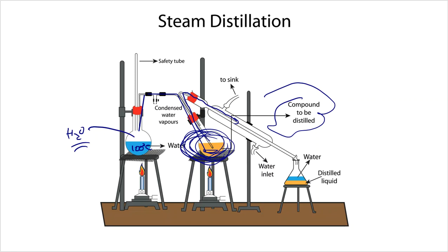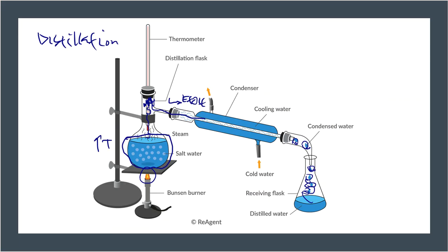So in the last video, we were talking about different types of distillation. We went through what we would call a simple pot distillation, which is something simple that we just need to heat up and fraction or distill off. And that's kind of this depiction. That would be a simple distillation. So nothing too complicated, nothing too fancy, just a handful of different things in that solution that we need to heat up, evaporate off and condense back down in order to collect.